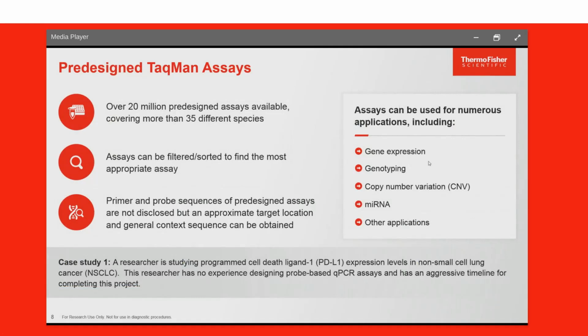And so now that we've level set on what TaqMan chemistry is, some of the nomenclature of TaqMan chemistry, the different types of probes, and the different formats in which you can order assays, let's jump into the meat of this presentation and the content that I think will be really useful to listeners.